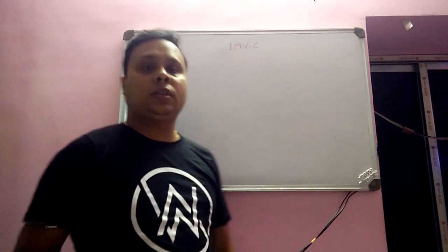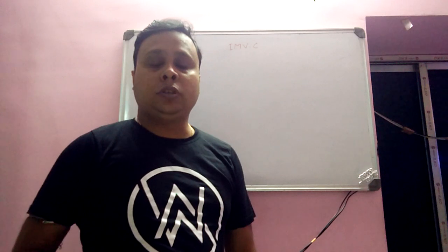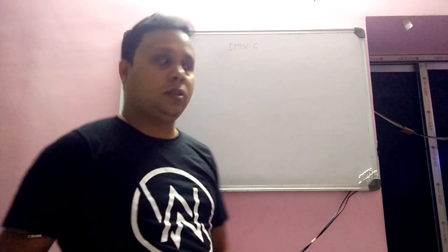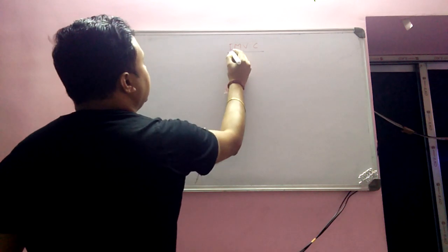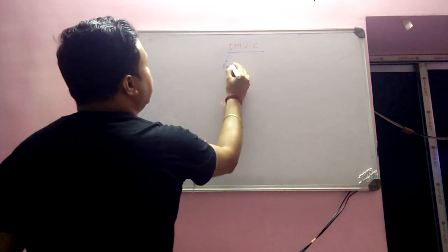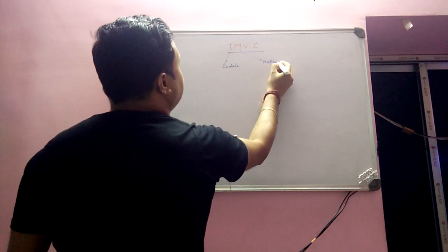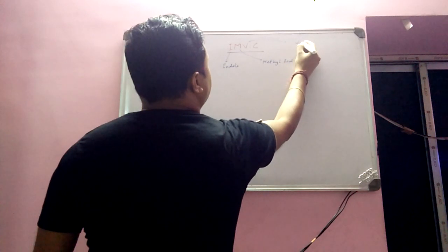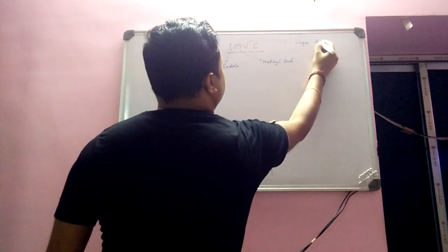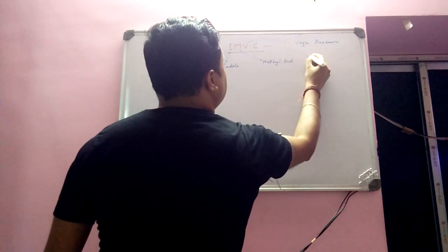So in order to detect whether the coliform organism is fecal or non-fecal, you need to perform several tests known as the IMViC test. IMViC means I stands for indole, M stands for methyl red, V stands for Voges-Proskauer, and C stands for citrate.